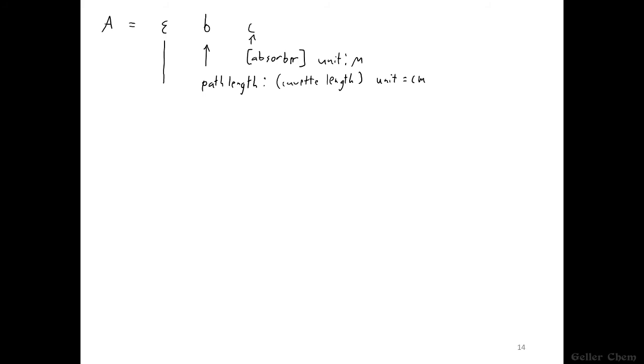And finally, epsilon represents something called molar absorptivity. For now, what we'll say is that this is related to the energy levels of a sample and is thus sample dependent. Different chemicals have different orbitals at different energies.